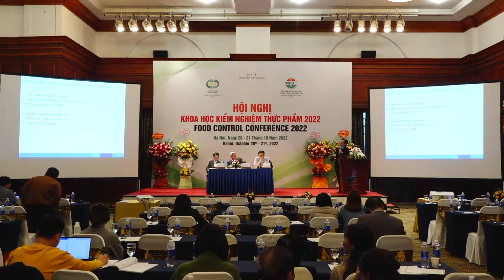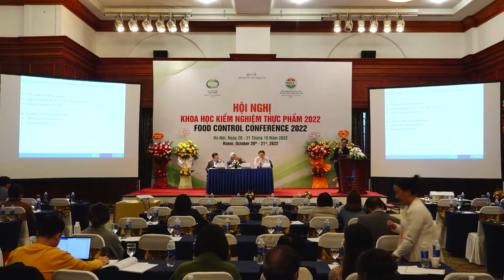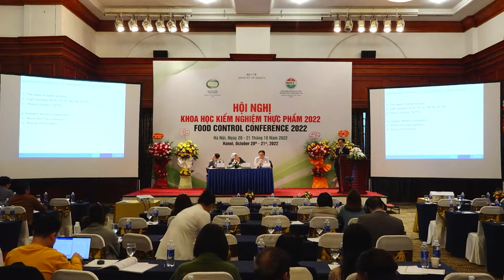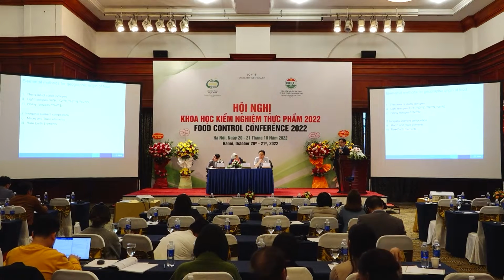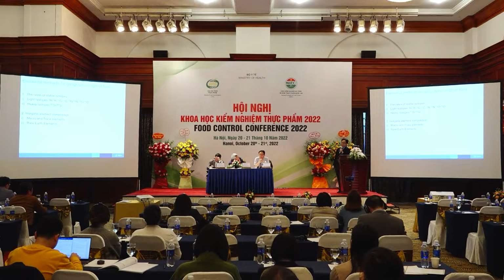Generally, to determine food origins with elements, I break them down into two types. Number one, we can look at stable isotope ratios. We can look at lighter isotopes like hydrogen, carbon, nitrogen, oxygen.